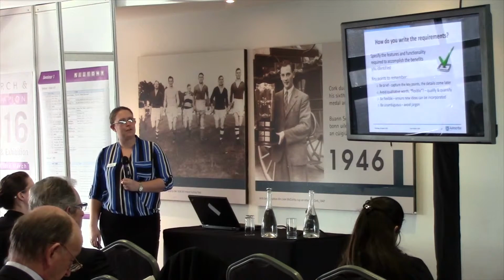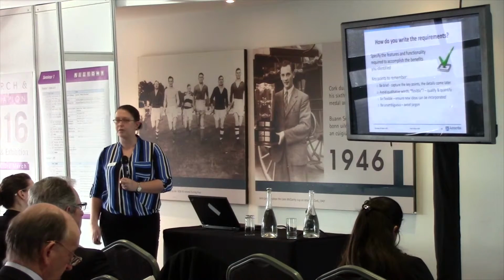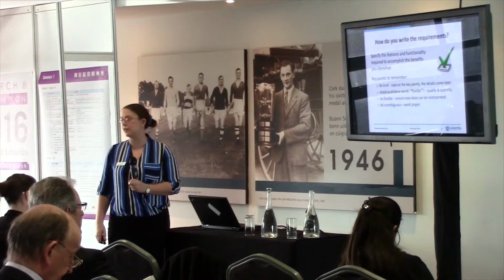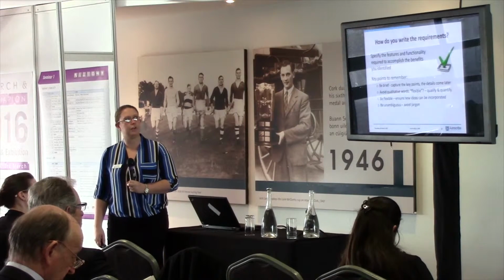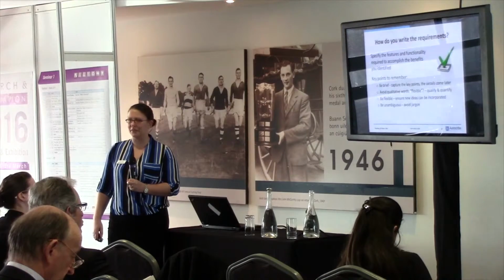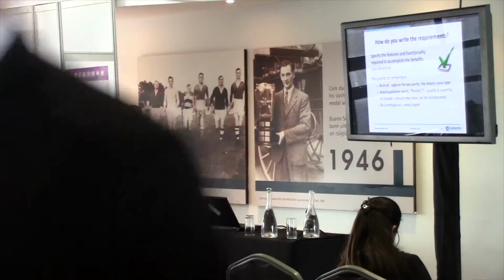So just some points to help you. It doesn't matter who you're buying a LIM system from; some of these points will really come to any of us. So, you need to be brief. Saying to us we want a flexible LIM system, everybody's like, yes, great, we've got one of those, we can give you that.